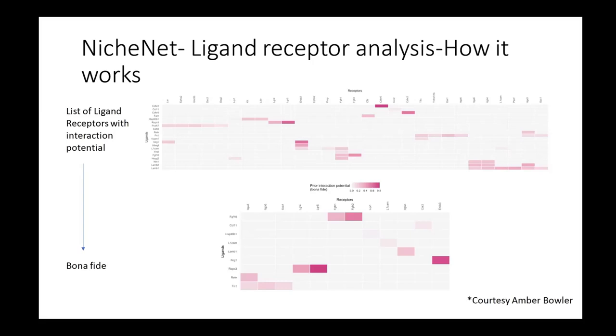the cell-cell communication. So here NicheNet is a little bit different because it's not only enabling you to look at pairs of ligand and receptor, but to associate that pair of ligand and receptor with changes observed. And therefore it might be quite relevant to make some assumptions, some hypotheses that need to be tested, of some communication that might happen in your dysregulated setting, so in the comparison that you did.